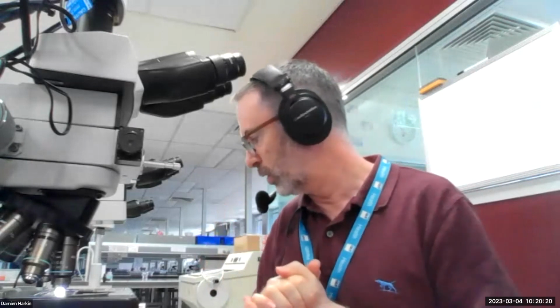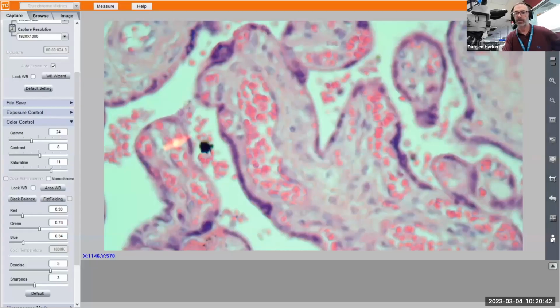Okay, so I'll stop sharing the screen there and we'll switch over to the microscope, and this will give us an opportunity to look at some slides, some actual examples. As I said, today we're going to look at formalin pigment and melanin, and we'll look at the results of these procedures that have been applied in order to clean up the section. So we'll switch over to the microscope here. I'll just enlarge that so it's a little bit clearer. There we go, bring that to focus.